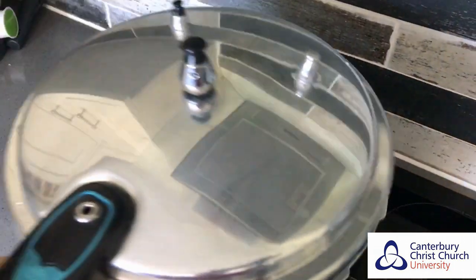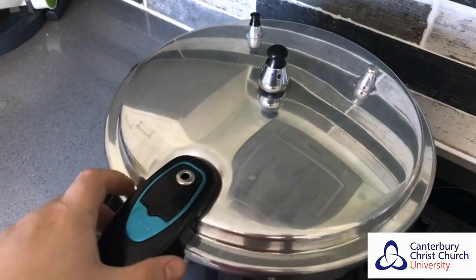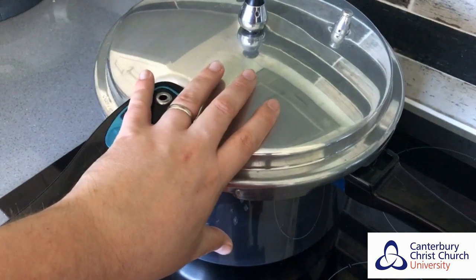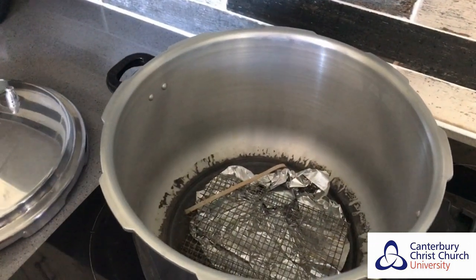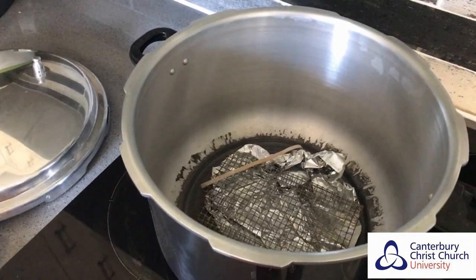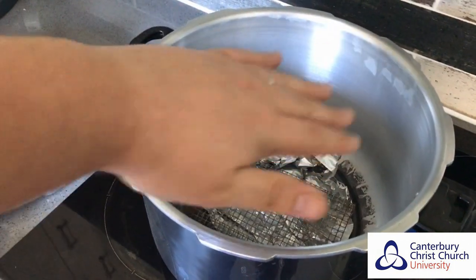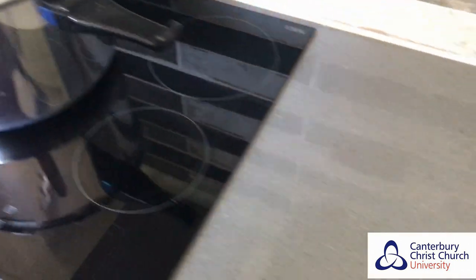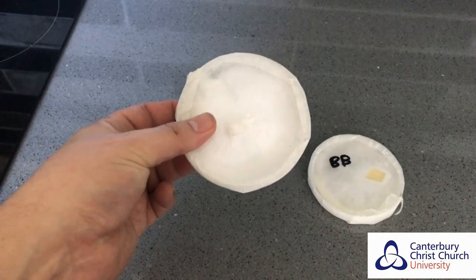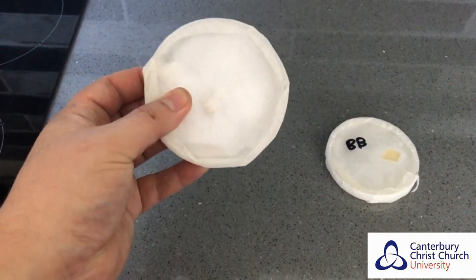This is a pressure cooker — essentially a pan which you can heat up on a hob, which has pressure release valves. Once it's sealed completely, the pressure builds up to a very high level inside this canister, which will heat and pressurize whatever's inside and completely sterilize it. We can produce a nutrient medium, mix it up in jars or bottles, place them inside this container, and pressurize for several hours until completely sterile. We then add the sterile medium to clean sterile petri dishes, let them set, and add our mushroom culture.